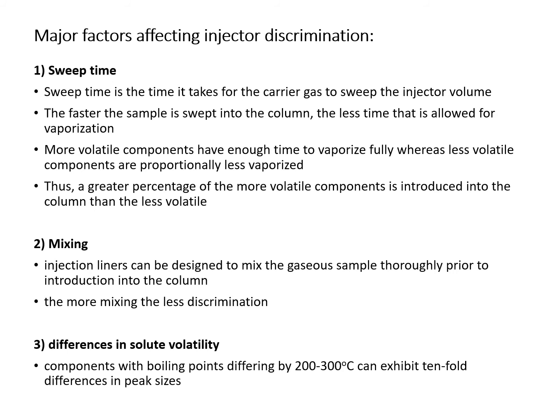Thus, the more volatile components have enough time to vaporize fully, whereas less volatile components are proportionally less vaporized. Mixing: injector liners can be designed to mix the gaseous sample thoroughly prior to introduction into the column. The more mixing, the less discrimination.